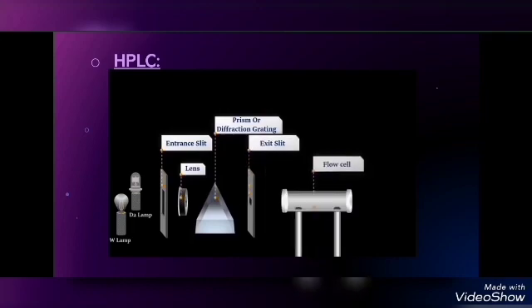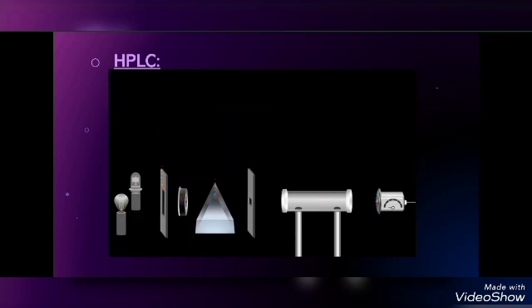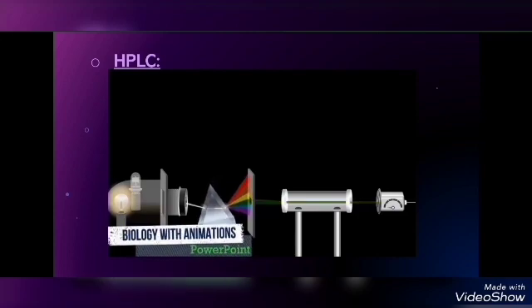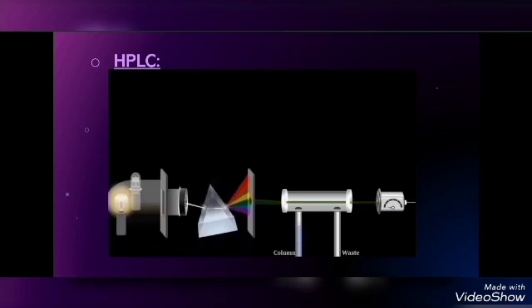Light from the lamp is shone onto the prism and dispersed according to wavelength. When the measurement is performed at a specific wavelength, the angle of the prism is adjusted so that the light of this wavelength can shine on the flow cell as the compounds elute from the column. They enter the flow cell, where the bonding and non-bonding electrons of these compounds can absorb energy in the form of UV or visible light.